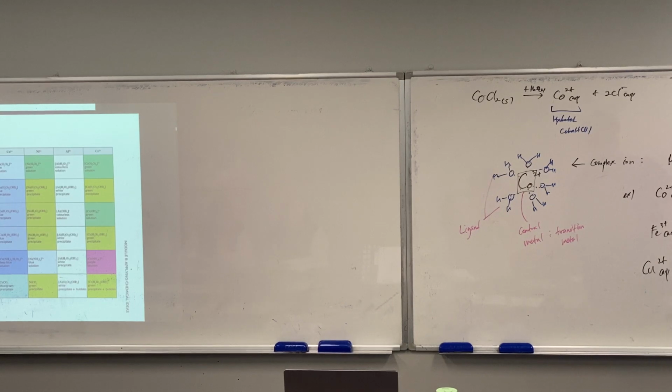It changed the colors. Can you see that? It used to be pink, sorry, gone red, now turning to purple blue. We kind of discussed that this is probably changing the pH, according to Le Chatelier's principle, making a shift to the left-hand and right-hand side, turning the colors back. Which means if I add some acid into it, I don't have acid here, it turns back to the color of pink as well too. But you can actually see that there's a bit of a chunky precipitate formed too. This is the cobalt hydroxide precipitate formed inside.